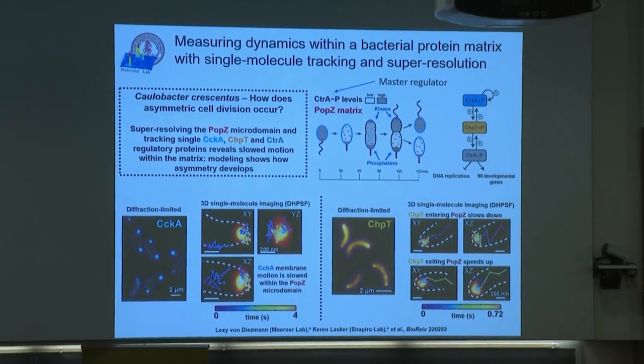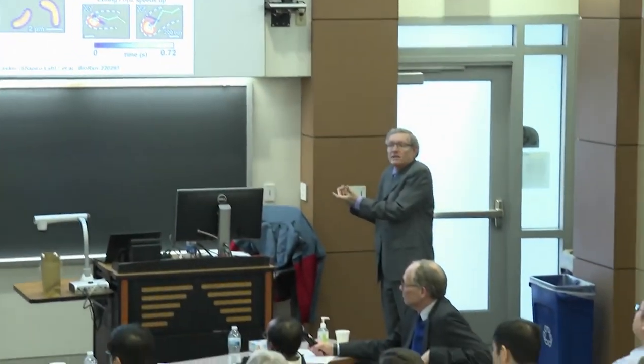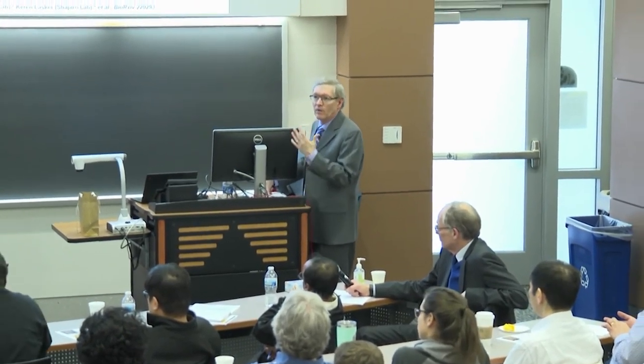If you want to get much, much more precision, then you have to wait a little bit or force the photons to come out faster. Turn the laser intensity up and use that finite set of total photons that you get in a slightly different way. Anyway, sorry for the long answer, but milliseconds are easy, or generally done. And there are a number of processes where milliseconds can tell you that there are interesting changes in motion already occurring. Let's save the remainder.